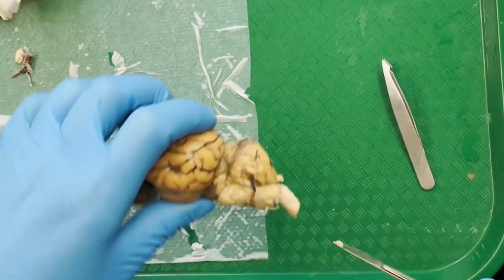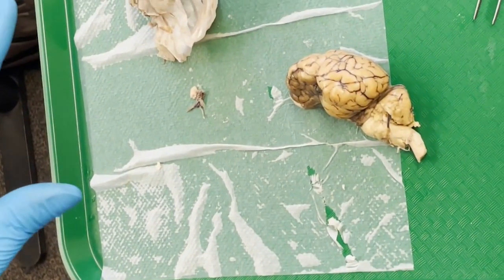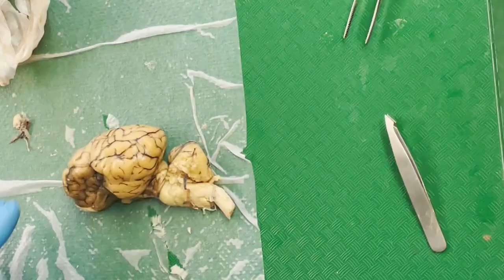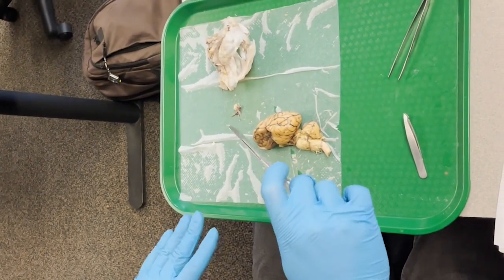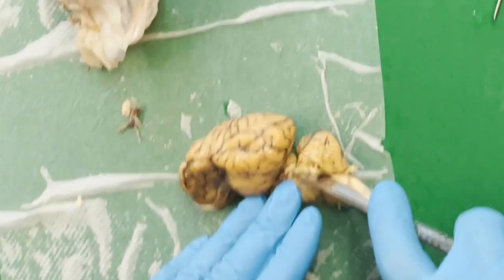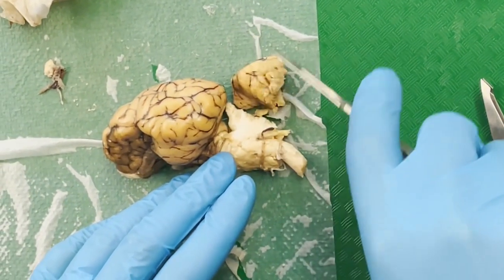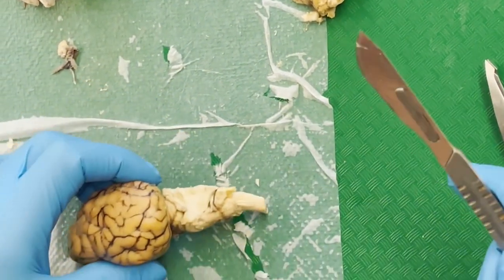Now, one way that you could go about this is that since we have a sagittal section, we can put flat side down and it stays put. And so we can cut into the cerebellum at a 45 degree angle, into the cerebellum, not toward the brainstem. So I'm cutting this direction here, and I'm aiming it at the cerebellum, sort of at the base of it, and I'm cutting outward this direction. So now, that should remove most of the cerebellum. We still have cerebellum attached, but this is gonna be easier for us to work with.